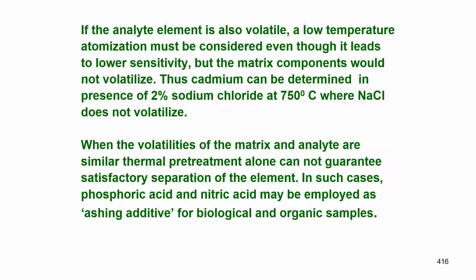When the volatilities of the matrix and analyte are similar, thermal treatment alone cannot guarantee satisfactory separation. This is a very important point. That means when the volatility of the analyte and matrix are similar, then you have to do the typical normal background correction.